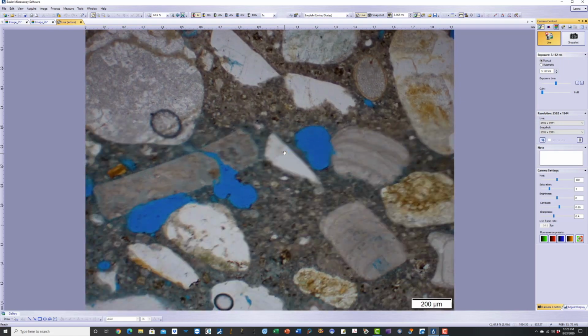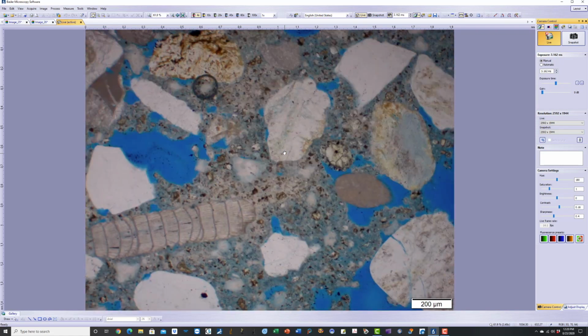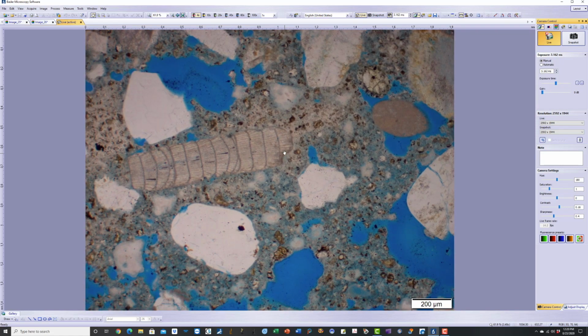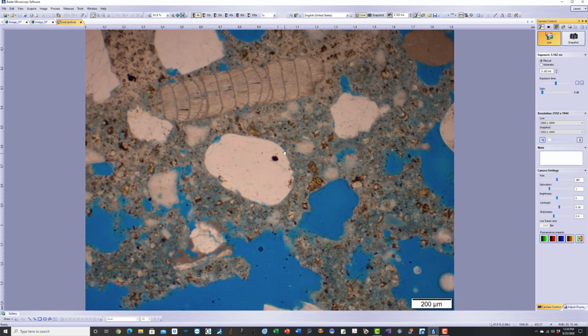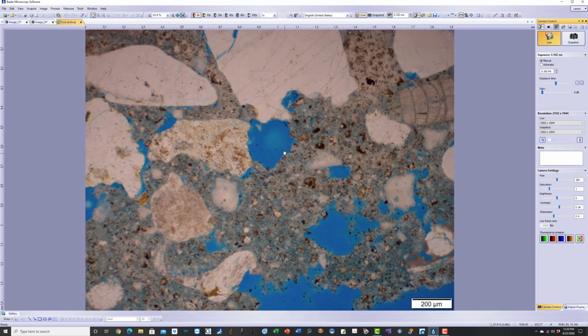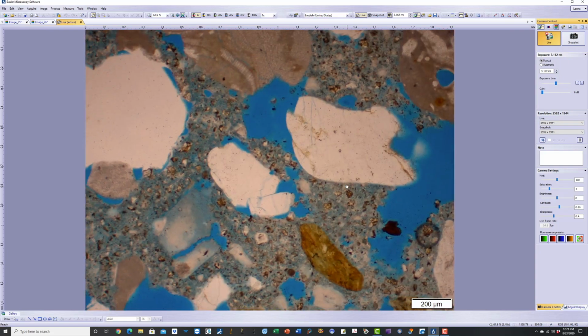The entire mortar coating should have been that kind of dense, but the interior, the majority of the mortar coating, is rather porous with a lot of cement hydrates and residual cement particles. All these cement particles should have been hydrated to decrease the overall porosity of the paste for this coating to be effective to prevent migration of corrosive agents from the air.